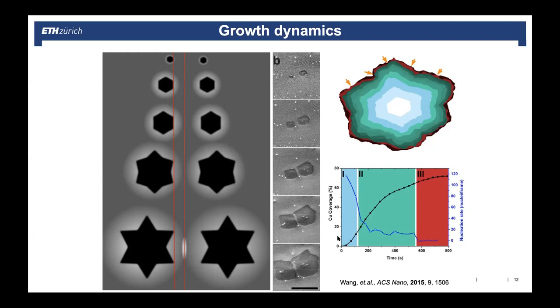And then at one point, this depleting layer, the feeding layer at the growth front, when the neighbors start to overlap, that's around here, there's competition for growth species. And then growth really, really slows down. And in addition, more and more of the surface of the catalyst gets covered, which is not good. And then growth further slows down until growth and etching, because you have hydrogen all the time, is in balance, and then growth stops. So you can then do a trick. You can just increase the pressure. And we did that. So you can increase the pressure. You have more ethylene in the atmosphere, then you can actually reinitiate growth.